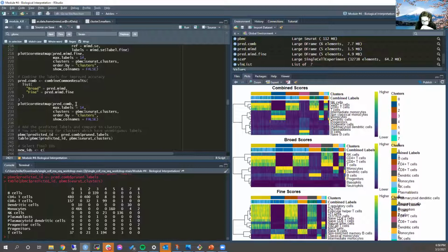Hengi asked for the heat map. Is there any way to drop out the levels not used from the reference, since the total type of clusters are less than the types of labels from the reference?